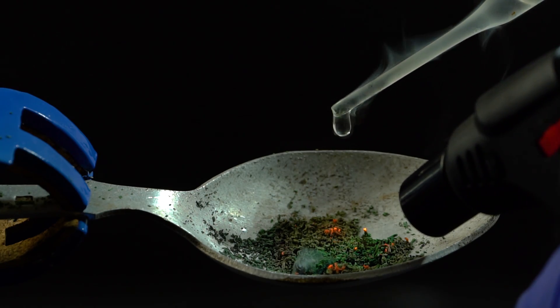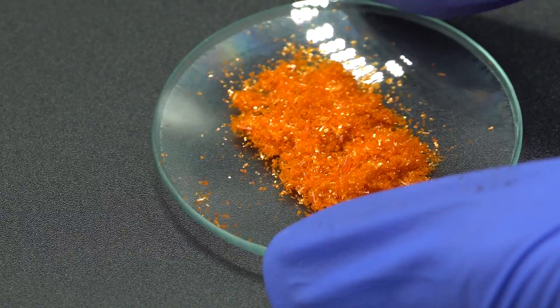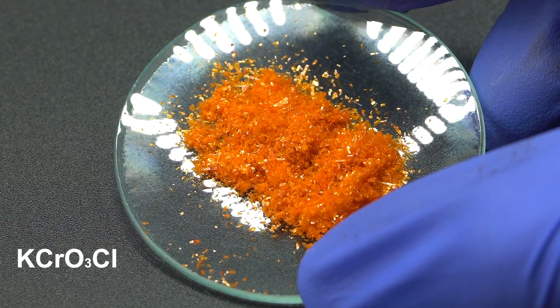So guys, is there really no way to set liquid ammonia on fire? Well, there is — please welcome potassium chlorochromate, the potassium salt of chlorochromic acid.